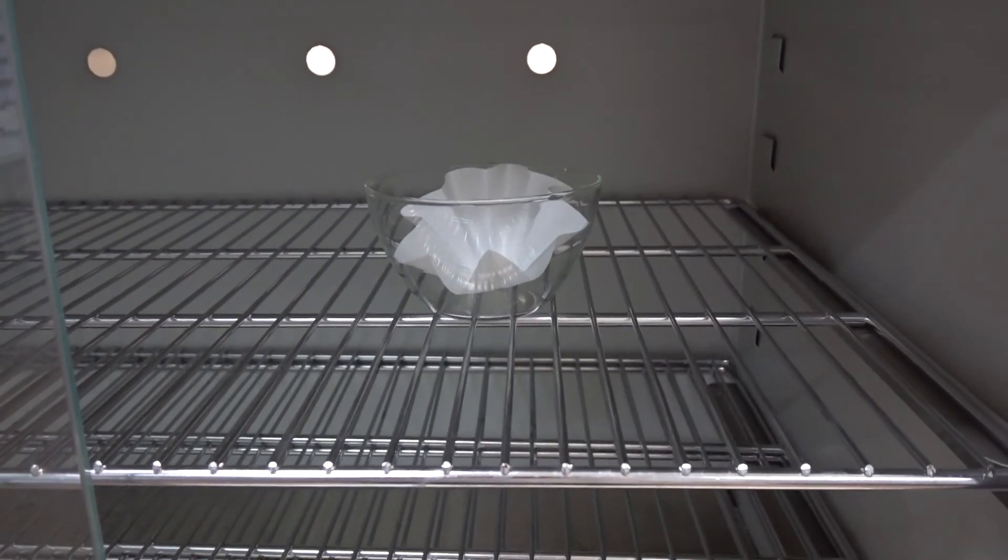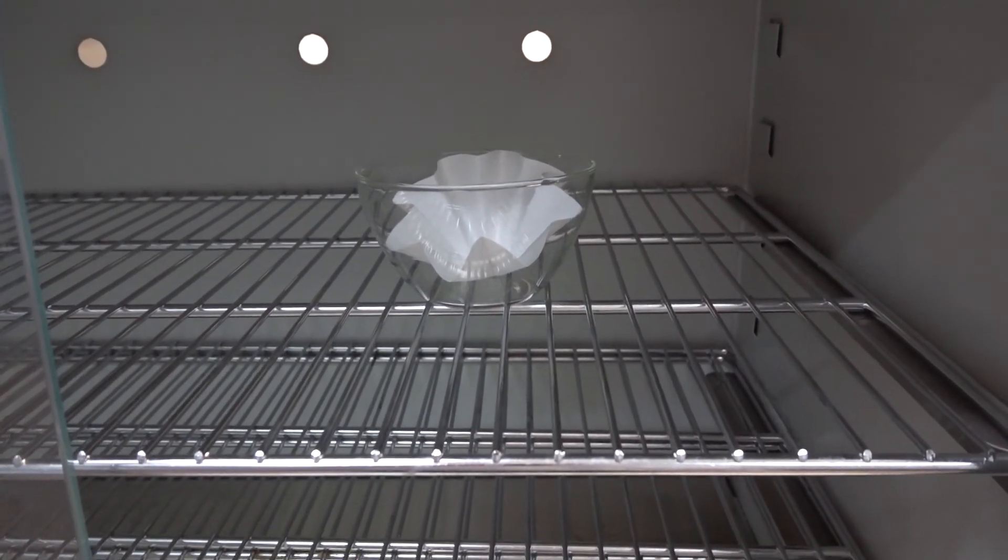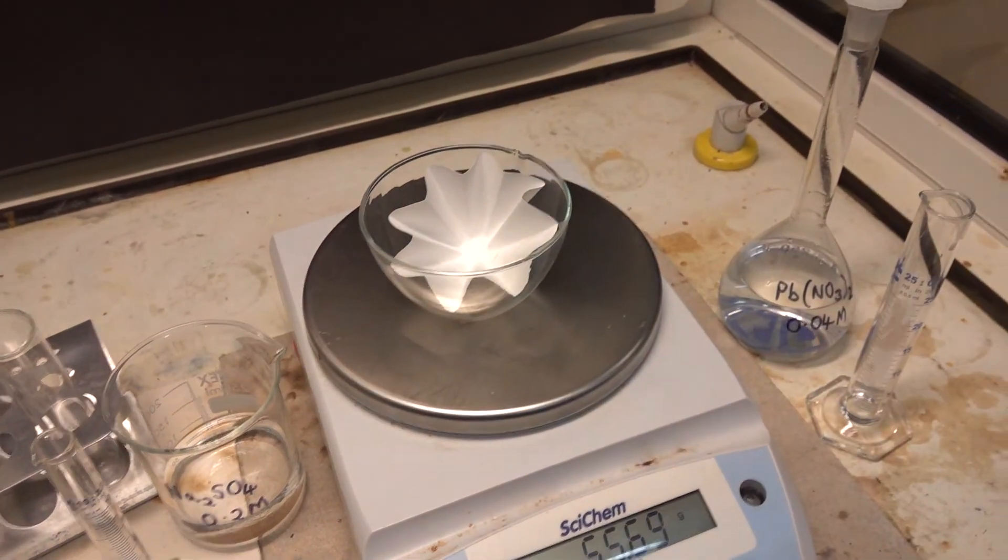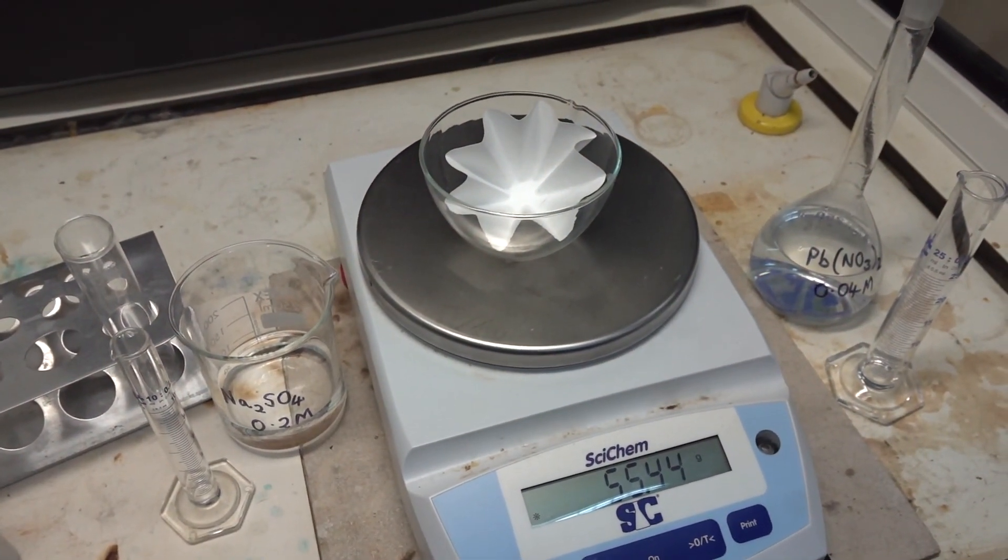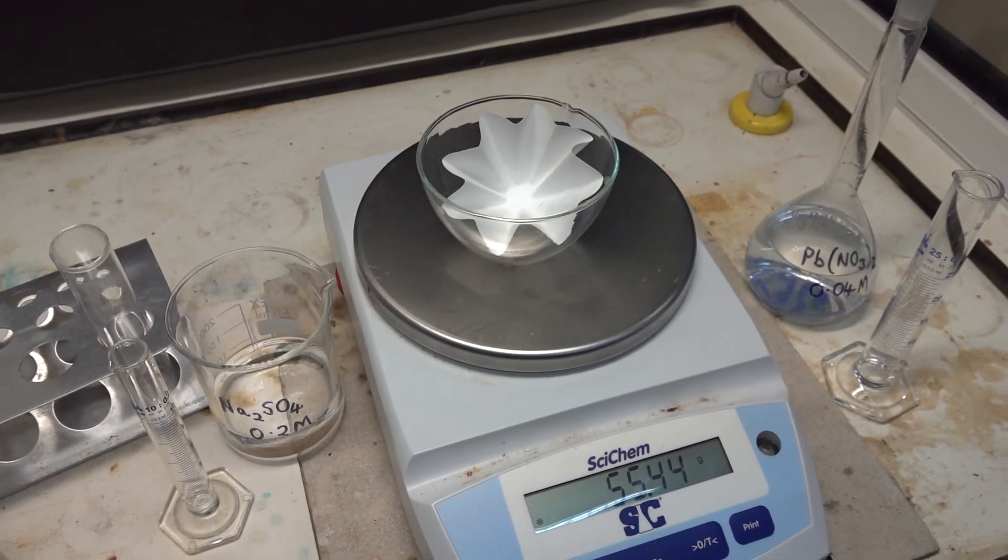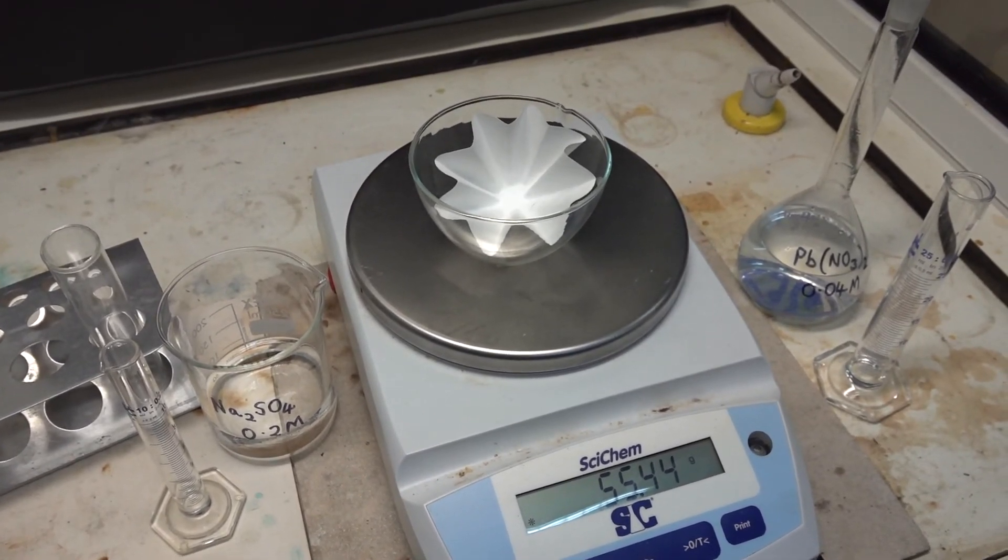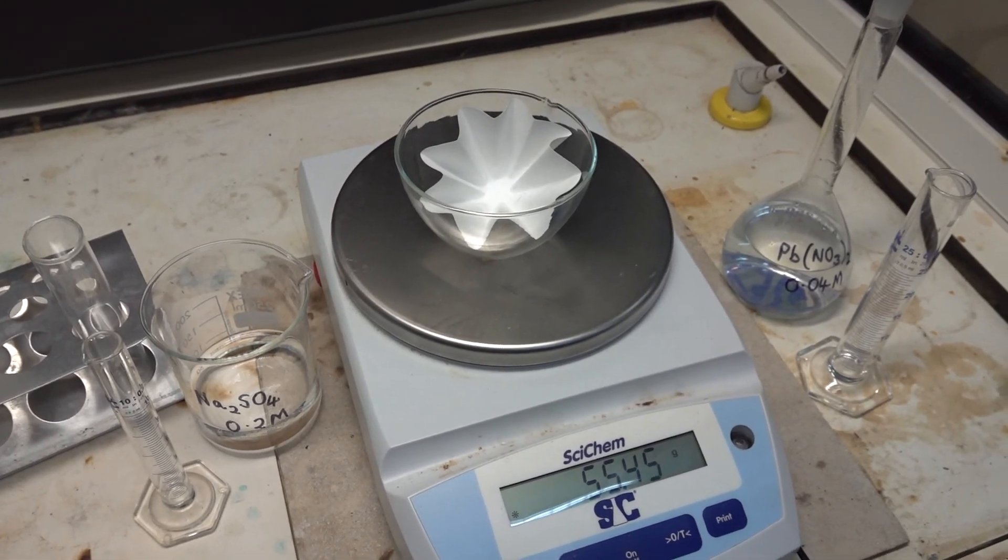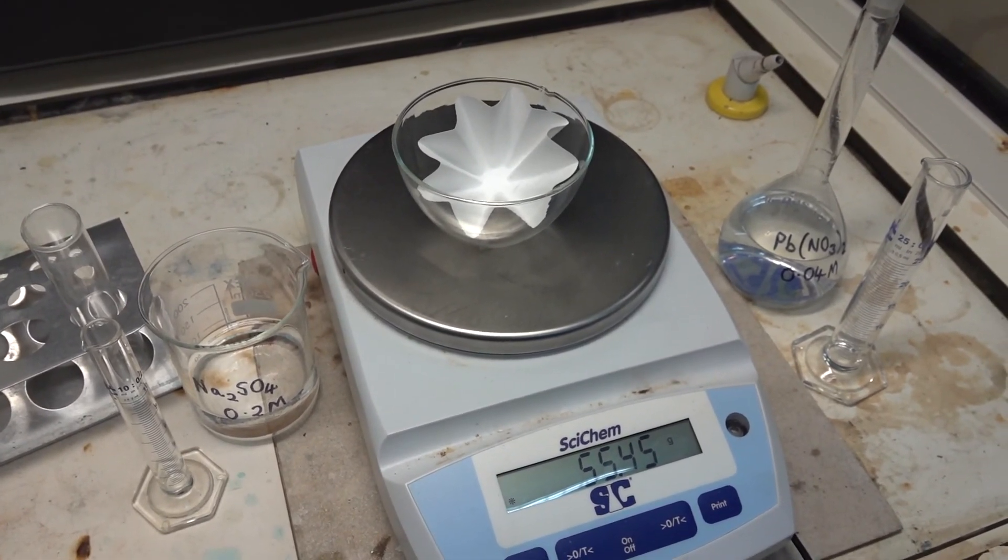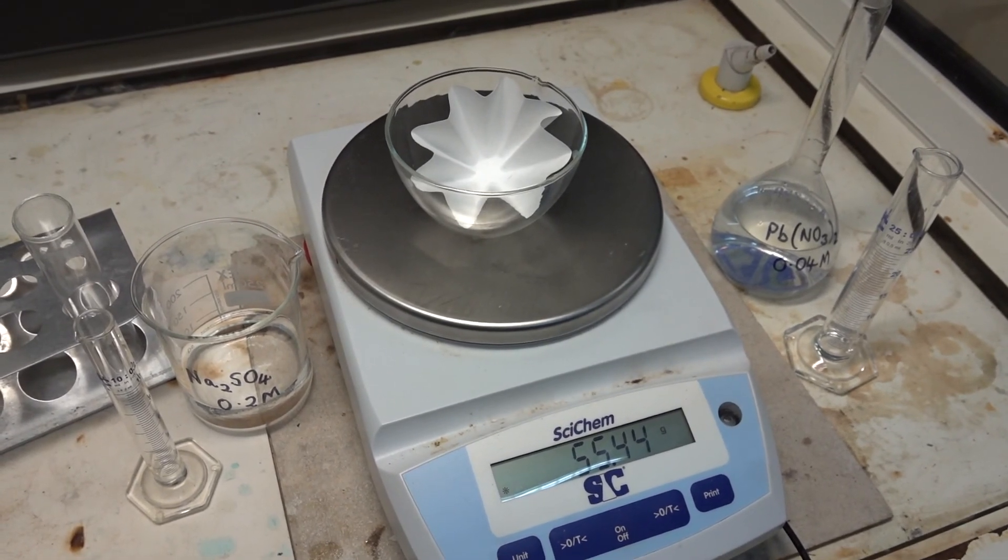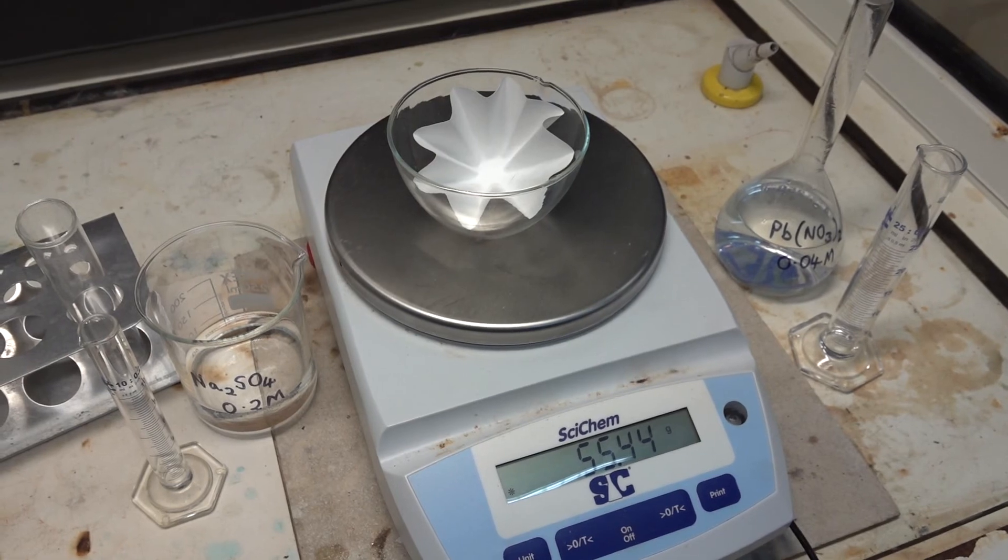Now that the precipitate has dried, we need to find the mass of the product, and we do that simply by transferring to the balance and weighing the total mass: 55.44 grams. From our readings we can calculate the mass of the lead two sulfate produced and also calculate the percentage yield.